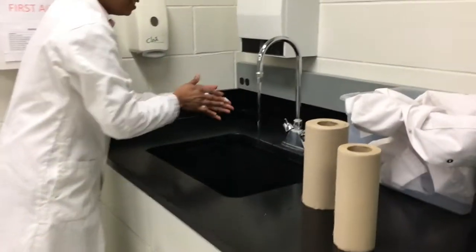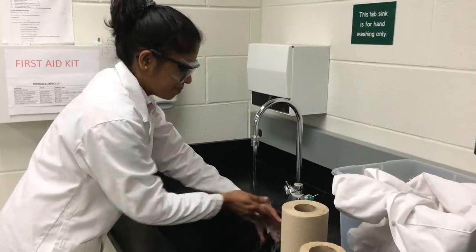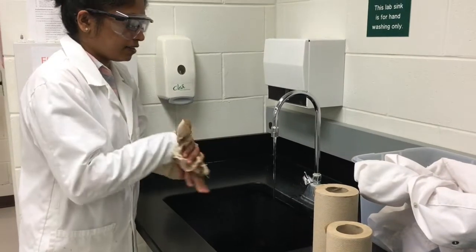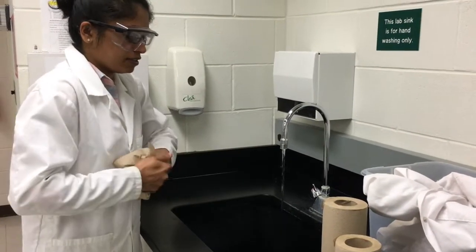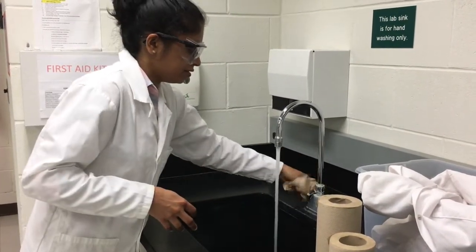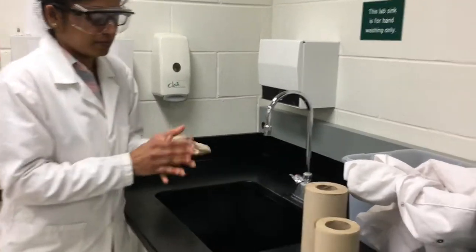Be sure to wash your hands well with soap and water at the start of every laboratory. After drying your hands with paper towel, be sure to use the same paper towel to turn off the nozzles to avoid recontaminating your hands.